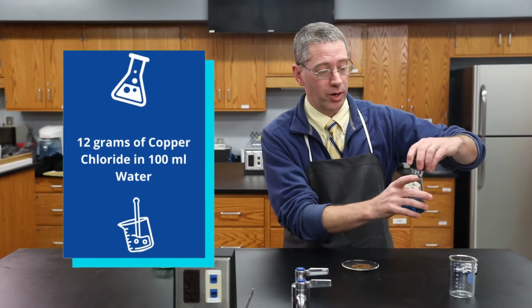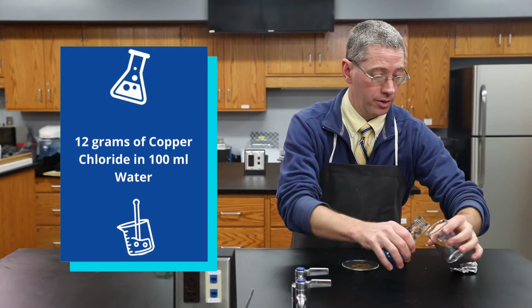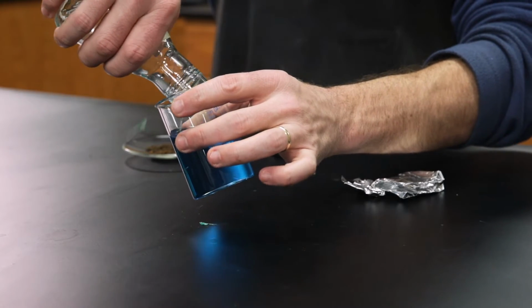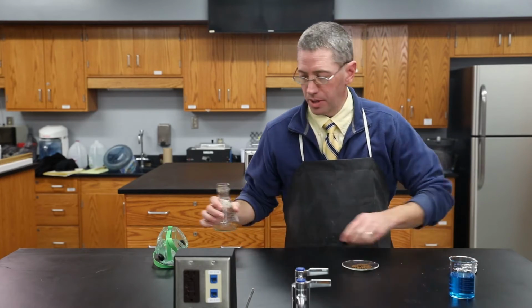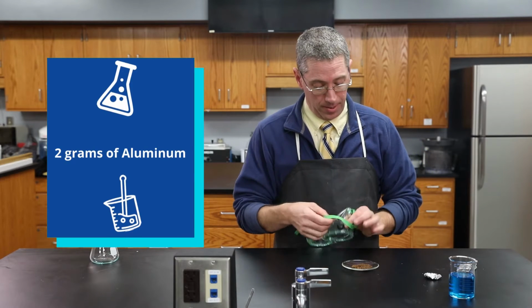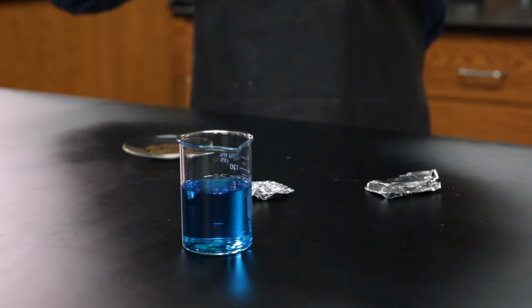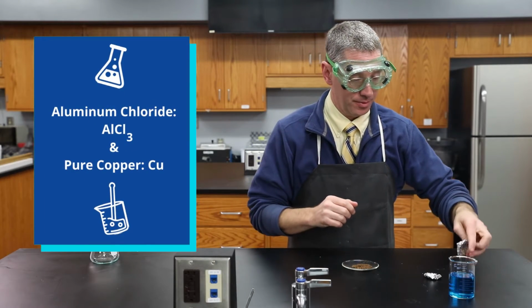I have 12 grams of copper chloride dissolved in 100 milliliters of water. And we're going to add 2 grams of aluminum to that. The aluminum will come in and replace the copper, resulting in aluminum chloride, which is a liquid, and pure copper metal.